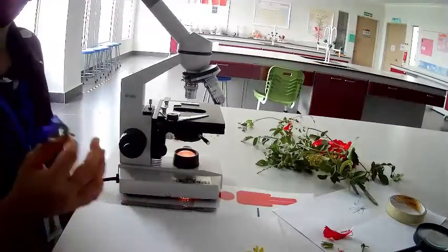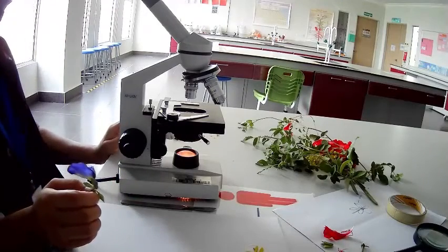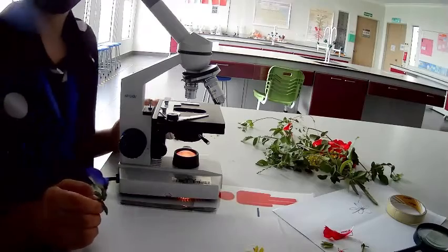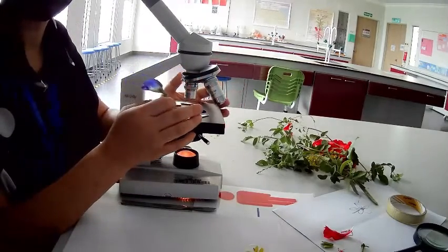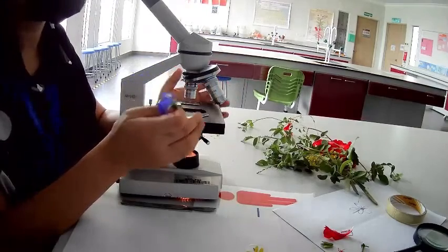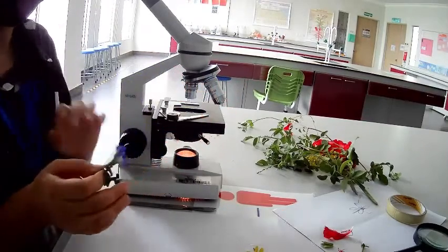So I will show the photomicrographs of those parts of the plant that I have actually put under the microscope on the slide. I watched them with the lowest magnification. I will share them with you.